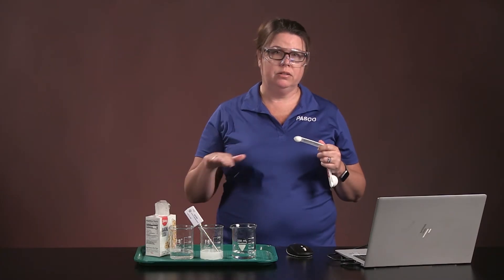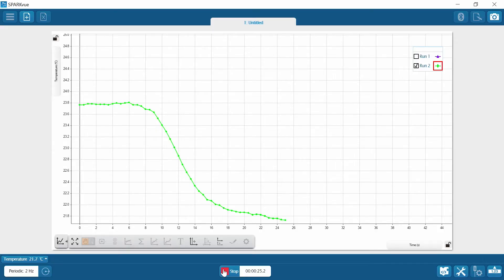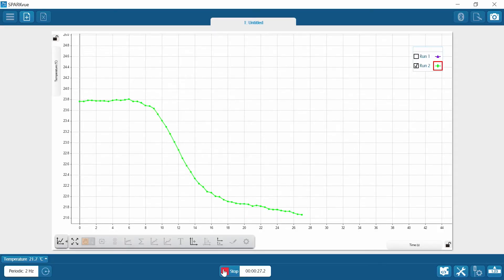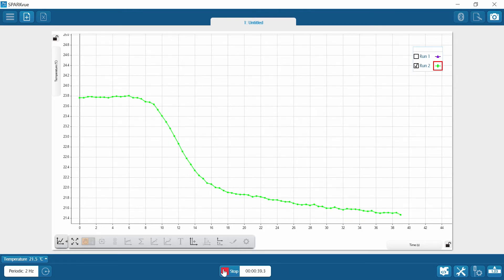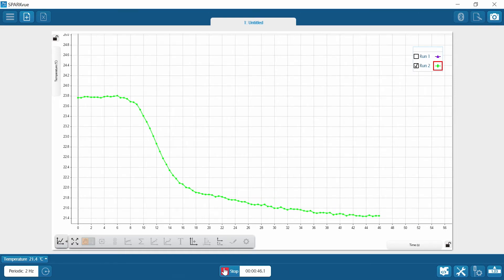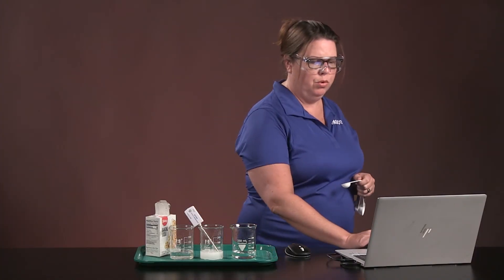We're going to wait for the data to level out. That looks good — I'm going to stop. And we're going to do one more run.